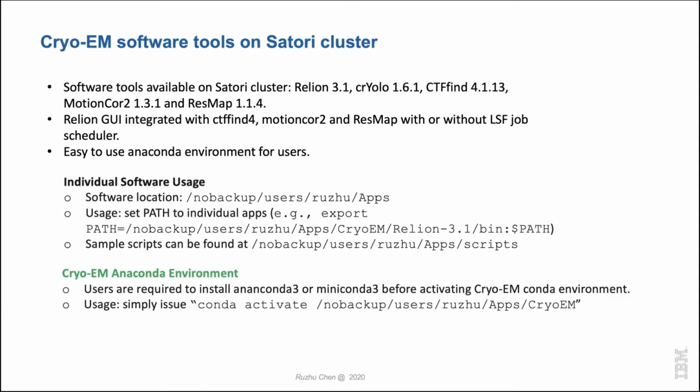I have also enabled EMAN2. It's a similar, complete package to run all the cryo-EM workloads. If you prefer using EMAN2, it's also available for you to enable.